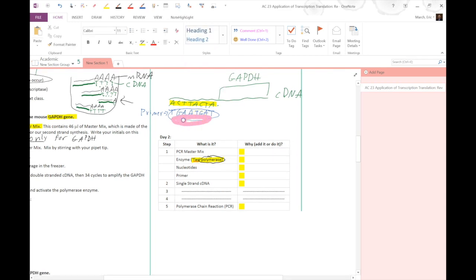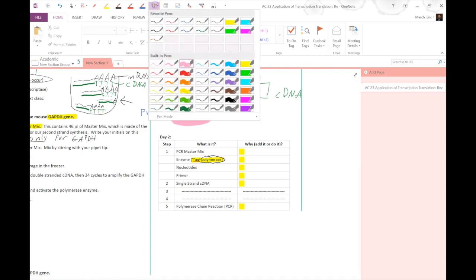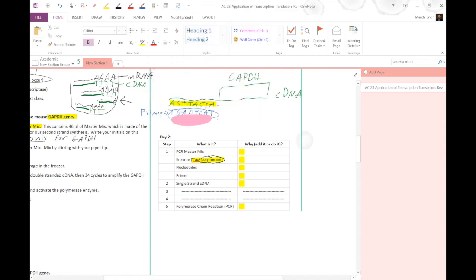it will bind onto our primer, and then it will go down the line, and it will insert nucleotides, and it will make a new DNA strand using the primer and copying the GAPDH gene. It will be the complementary strand. We also have a primer going the other way that will make a copy going this way. That's a little bit more advanced, and we can talk about that at a later point.